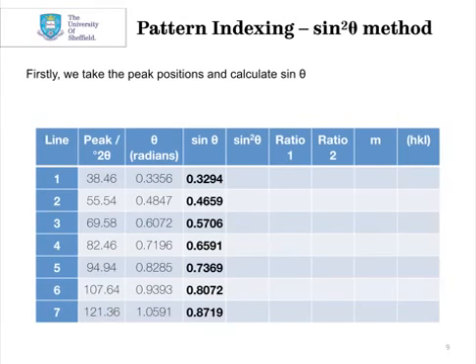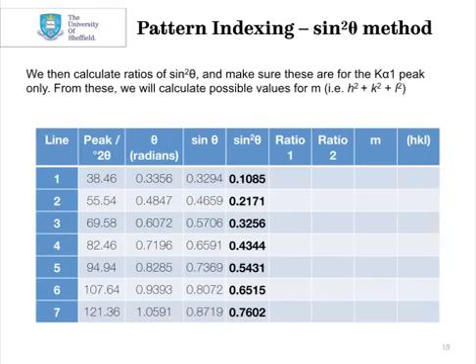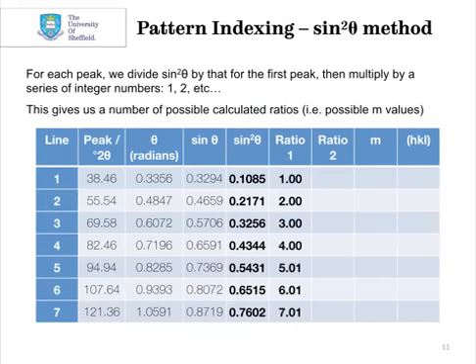The next step is then just to simply take the sine of that theta in radians. So sine theta for our peak at 38.46 becomes 0.3294, and so on. We can then also square those values, so just multiply 0.3294 by itself, and that will give us a sine squared theta value of 0.1085. So that's our sine squared theta value for peak 1, and so on. We then take the ratio of all the sine squared theta values compared against the first peak. Actually, you can pick any peak, but I tend to always work from peak 1.